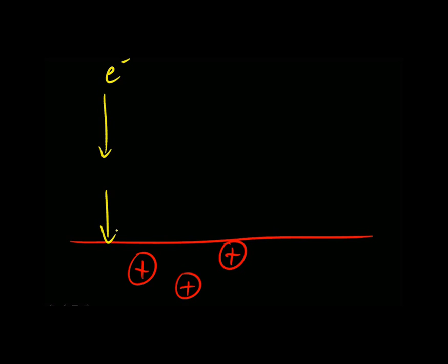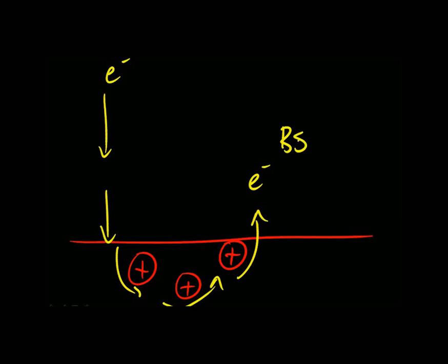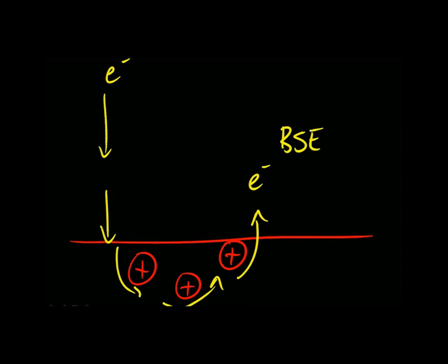But sometimes there's this type of elastic event which produces backscattered electrons. And these are high energy electrons. They can be emitted from well below the surface, microns below the surface, and they tell us information about what type of atoms are there.